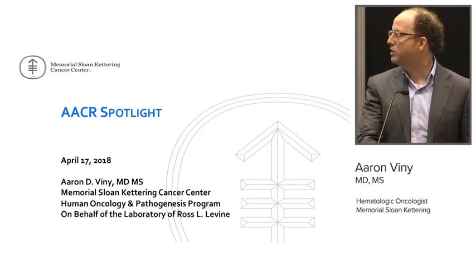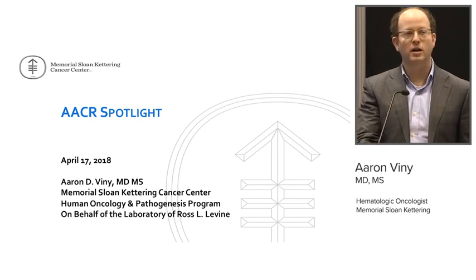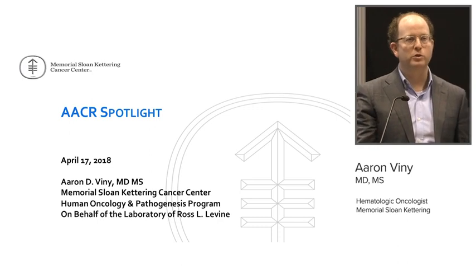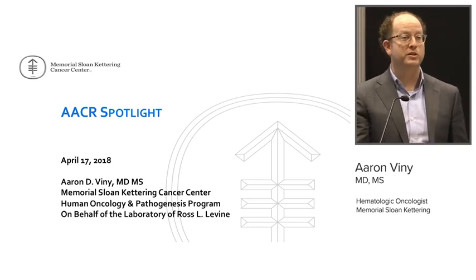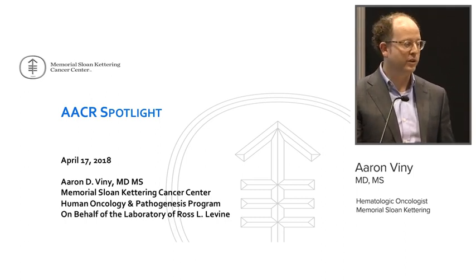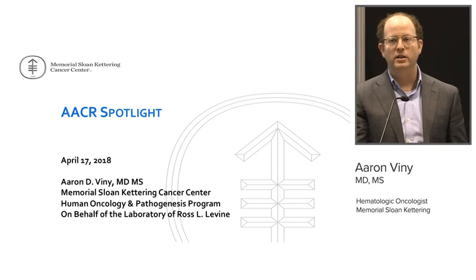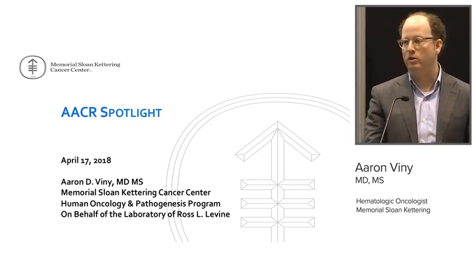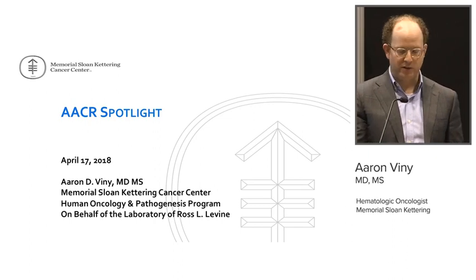I'll be presenting some early work on behalf of the Ross Levine Lab, where we're using this technology to help us evaluate minimal residual disease monitoring after therapy and clonal hematopoiesis. And really a critical part of that is a really precise understanding of the clonal architecture as the disease progresses.